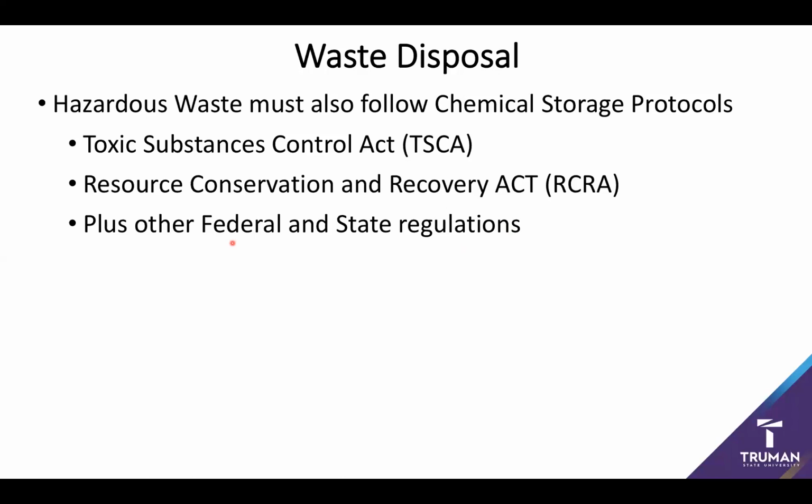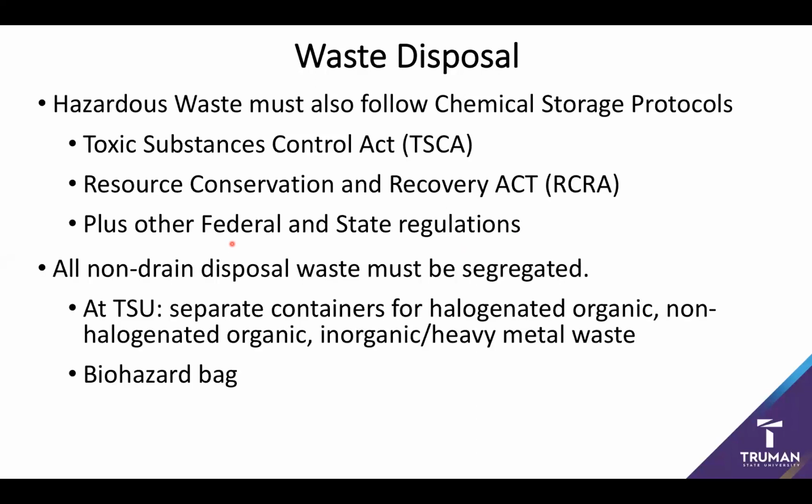One of the other important things to be aware of is, as we saw previously, make sure that when you're disposing of your waste, everything is separated according to appropriate category.